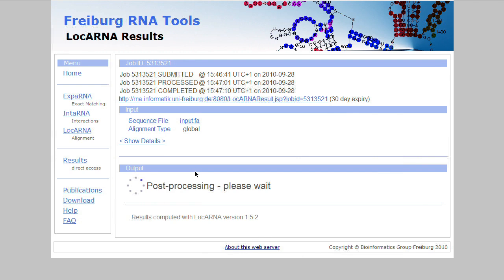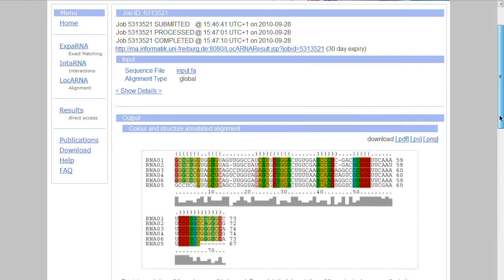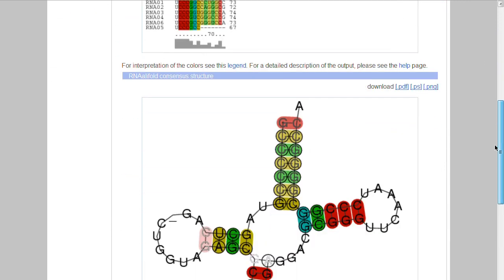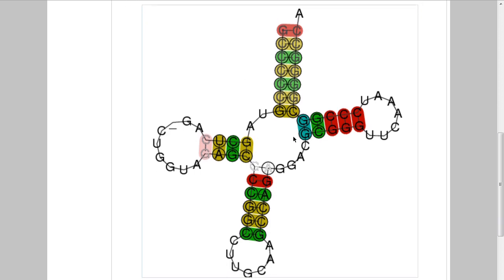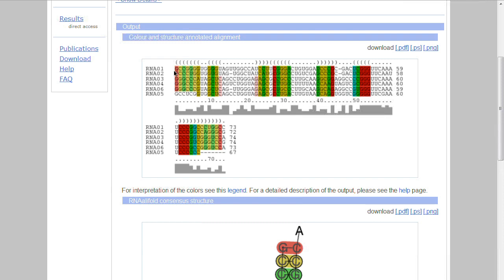Here we now have our result page where the output is still being processed. Now it is ready and you can see the alignment of these six RNA sequences in this image. Below this you can also see the consensus structure — the structure that all six RNAs most likely form together. Given that they all have a similar shape, the most likely shape they can all fold into is this one. The alignment is nicely color-coded, with different colored areas representing structurally conserved regions.